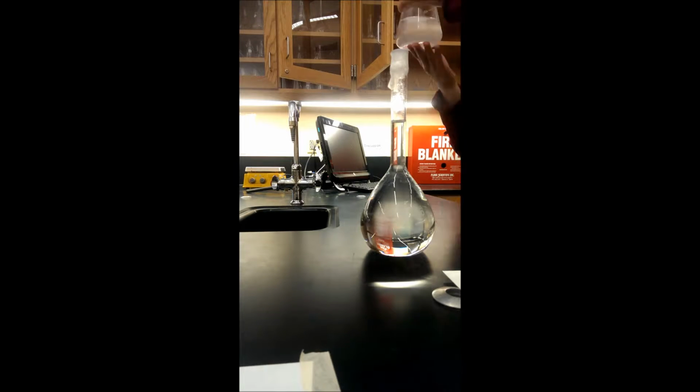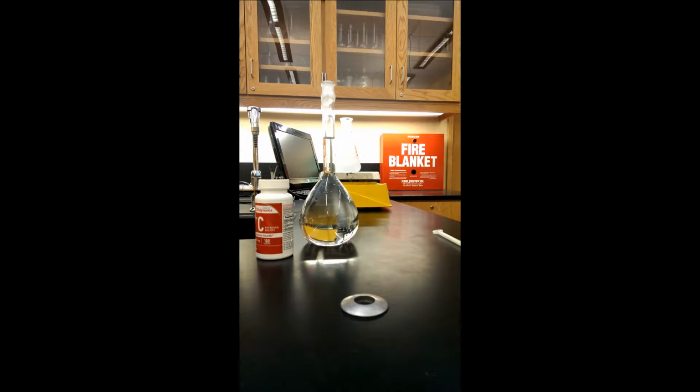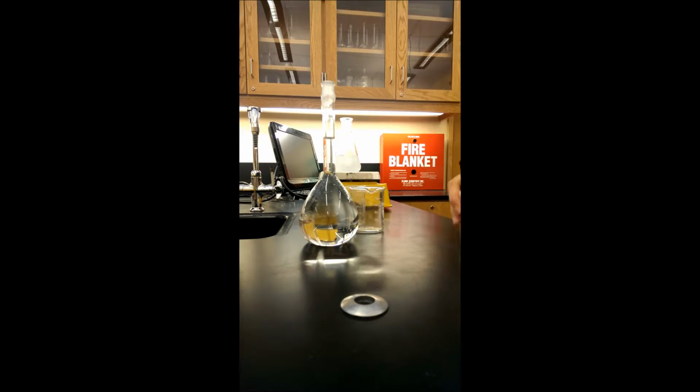So, part two, day two. I mean, now it's day two here, and continuing off where we left off with the starch solution and the iodide solution. And so I'm preparing for the titrations here.